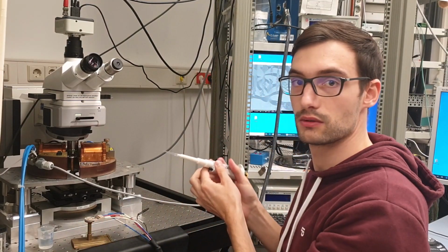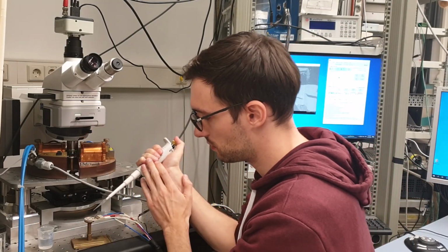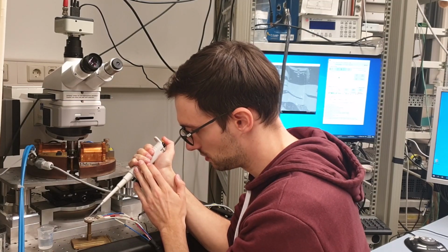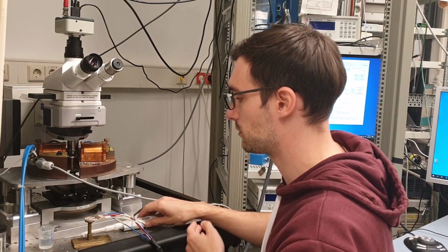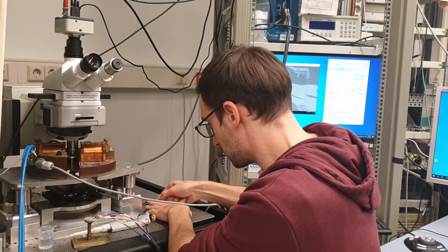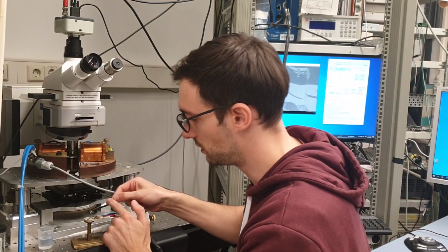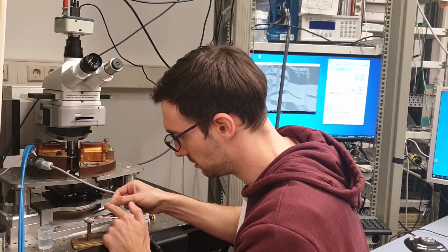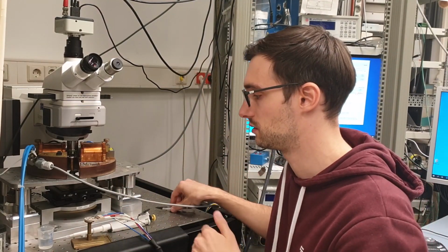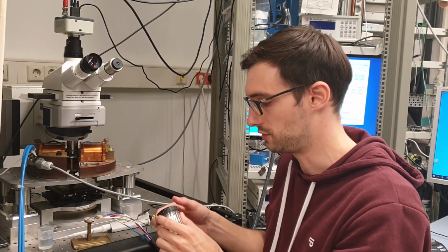Then we fill in the electrolyte like this. And it's also necessary to place a thin glass slide on top of the cell, because this ensures that we have a plane surface, and this is very good for the microscopy process.